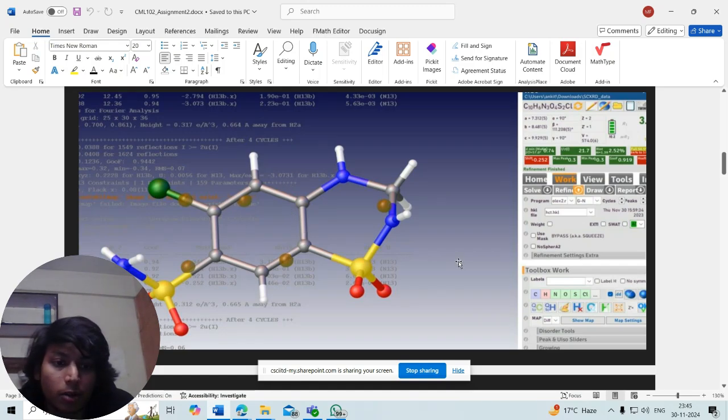So from here we do the labeling, we click on this atom and then we click on this carbon to get this gray thing, which is the notation for the carbon atom. Okay, and then basically this gives me a rough formula, and I'm not sure what kind of structure this is, but I will try to propose that this atom is this atom, and then we might get some better R factors, and based on that, we can say that the model is much better than the previous one.